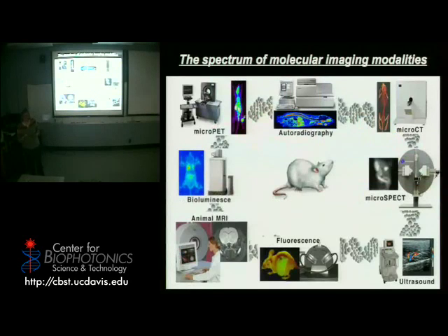And just to give you an example of how bioluminescence fits into the broader context of imaging techniques, it's no different really than things like PET, SPECT, MRI, a lot of clinical-based imaging approaches, like if you've ever needed to have an MRI done on your knee or something, or gone in for a SPECT CT at the clinic. This is a similar approach, bioluminescence, using some sort of light to interrogate tissues. And it's part of a whole class of different reactions being used at places like Stanford and research universities across the globe to gain insight into other types of biology.